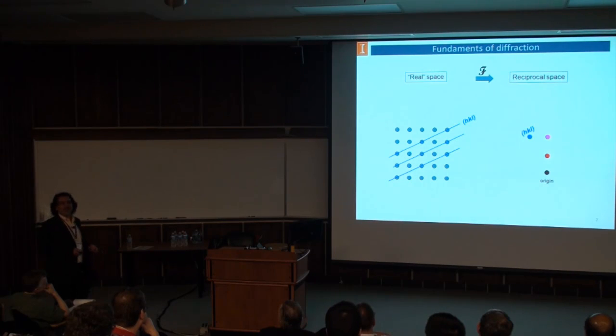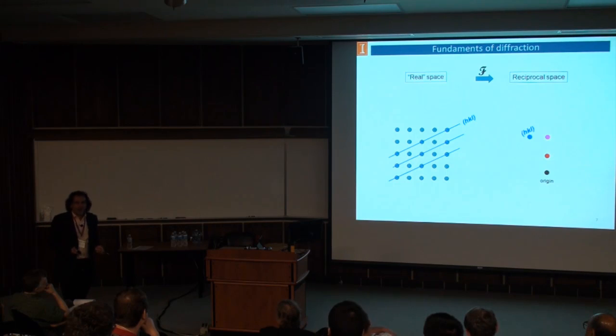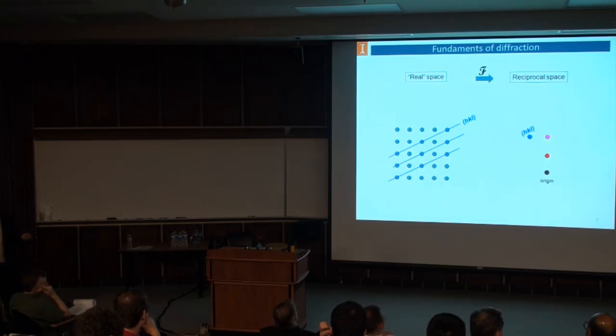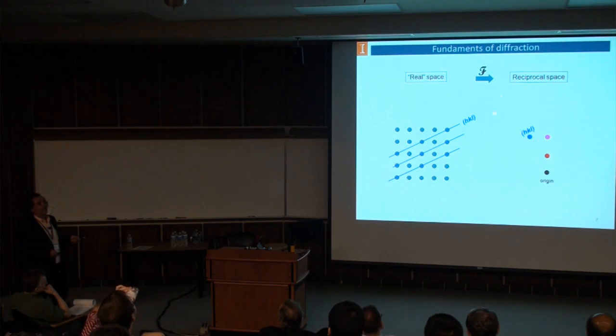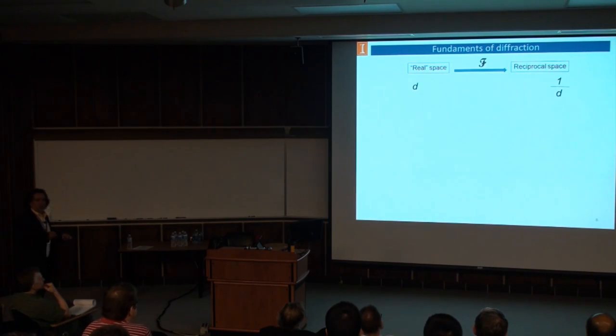It's just an exercise that you just pick things and just draw little cute boxes or circles everywhere there? No. We are actually going to use this to our advantage later down the road, because depending on what information we want to look for, we may actually look for spots that are here or spots that are actually tilted. Okay, so we're going to be walking around there and choosing which one to park. It depends on which information is going to be relevant for us to fish out from that measurement.